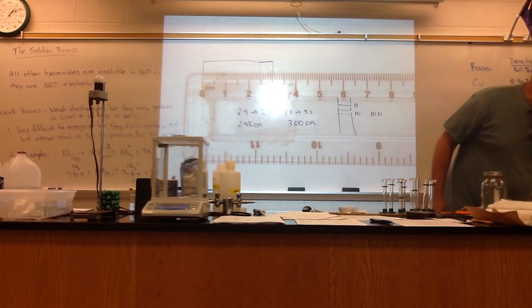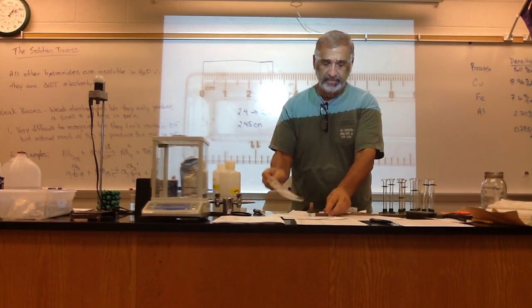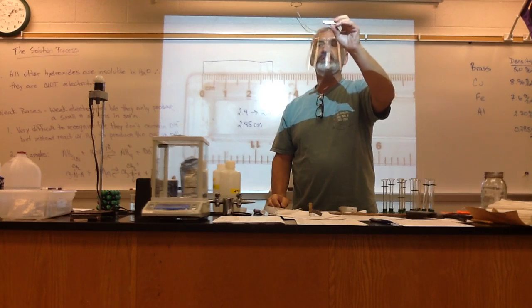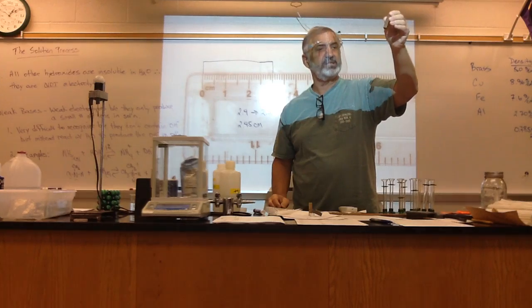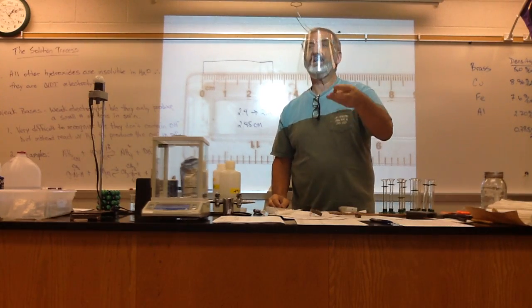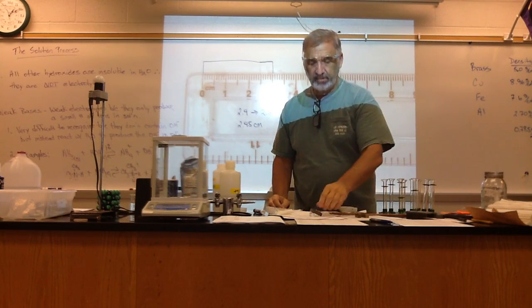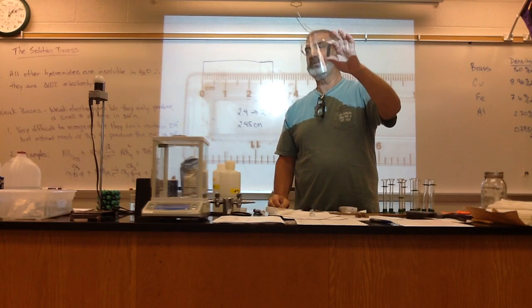You have to measure the metals. Now, when you're looking at these metals, the reddish brown one, what do you think it is? This is copper. So the reddish brown one is copper. The shiny gold one is brass. The dull, heavier, silver, grayish one is iron.